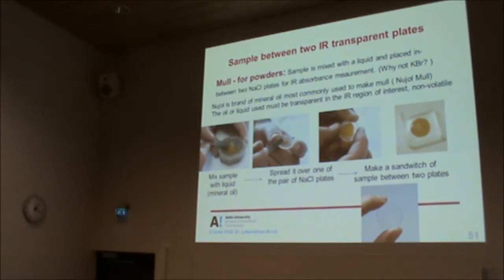So you have to choose which sample preparation you need. Sometimes this is better, sometimes the previous one is better. It depends whether you have the equipment. Second, whether the sample undergoes decomposition at high pressure. So it's mainly a practical choice. That's all. It's nothing to do with chemical stability, more a practical thing. So you place it between the sodium chloride plates and then you do the measurement.